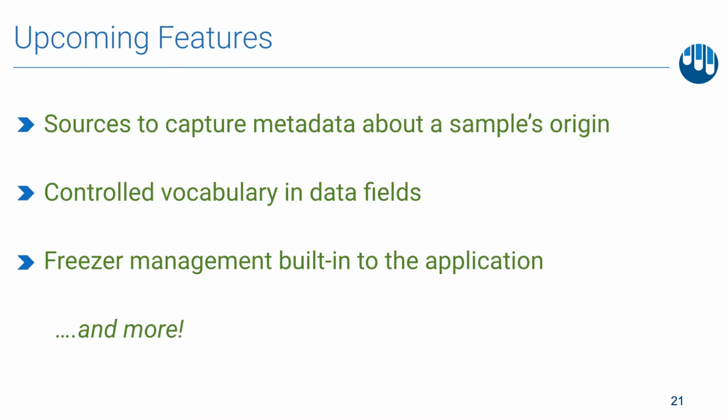There are a lot more features and functionality to come, and our team is really excited to learn from you and hear what's important to your team. As you saw in the beginning, LabKey prefers to listen to scientists' needs rather than dictate them, and so we're eager to continue growing this product with partnership and feedback from you.